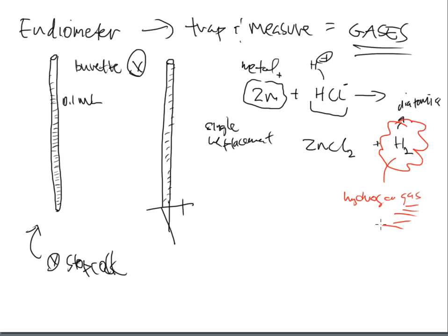So we often talk about products getting formed from reactions. We talk about maybe filtering those products and testing them to see what's there. We've talked about products that are liquids, and we can separate those liquids off and test them as far as boiling point, or density, or other chemical and physical property tests.